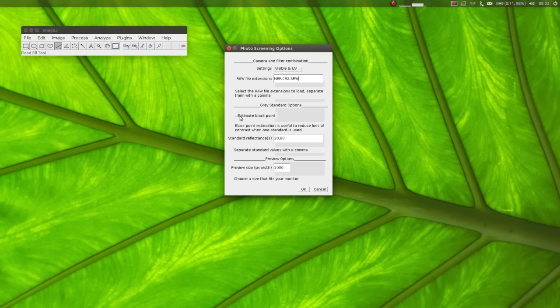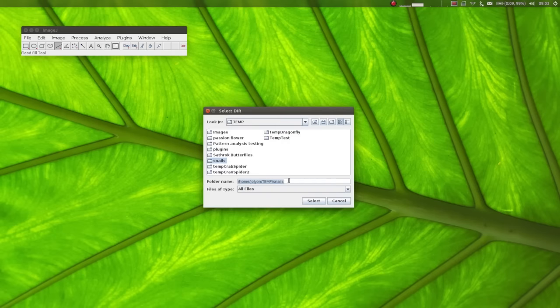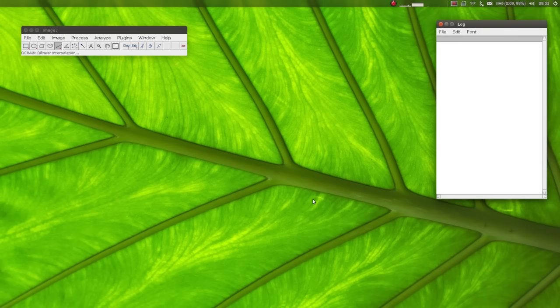Here we have the gray standard option, so whether to estimate black point. Again, I don't need to do that. Standard reflectance values. Again, I'll just put in 5 and 95. And we can specify the preview size here. So this will depend on the size of your monitor. I'll just leave it at 1000. Then I need to select the file containing all of the raw images.